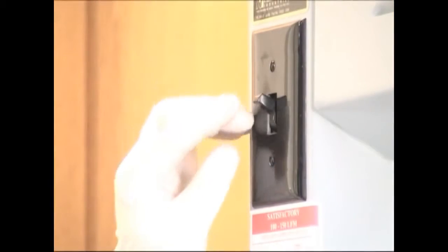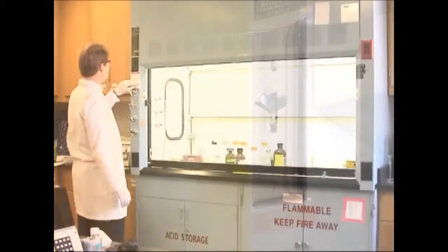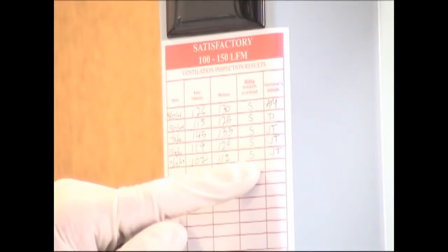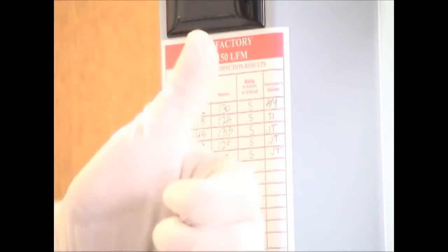When you use the hood, you should turn on the hood light so you can see clearly. Check the hood certification sticker — it will list the date EH&S last checked the hood, the average inflow, and whether the airflow was satisfactory.